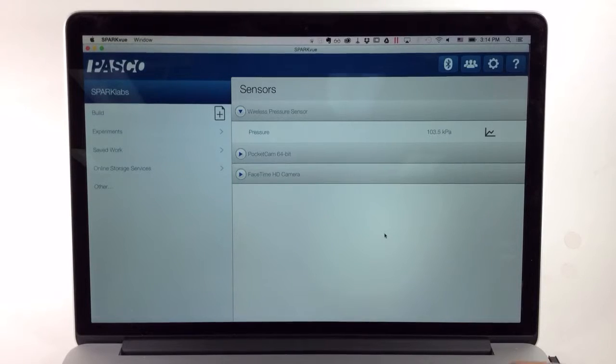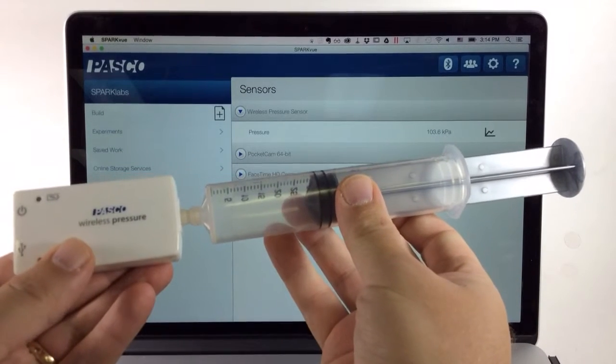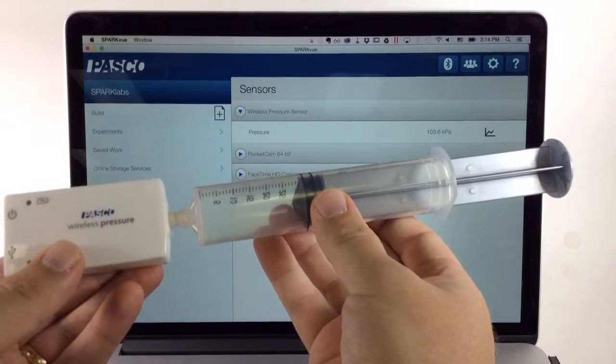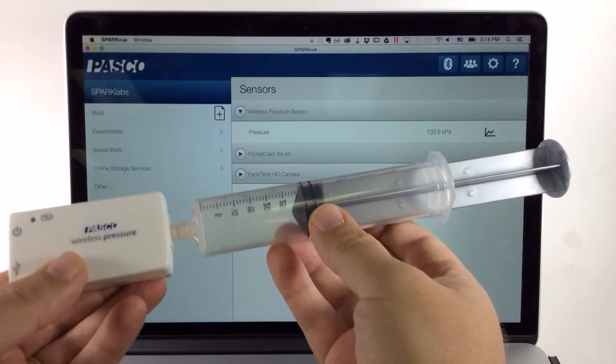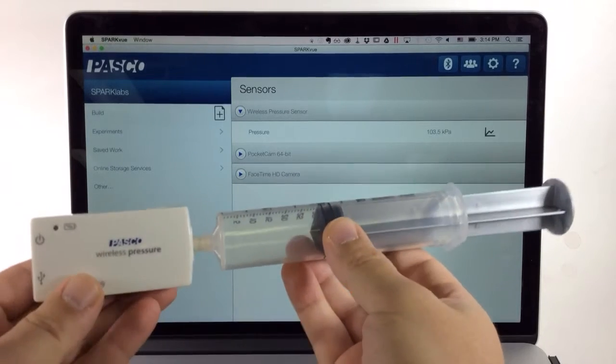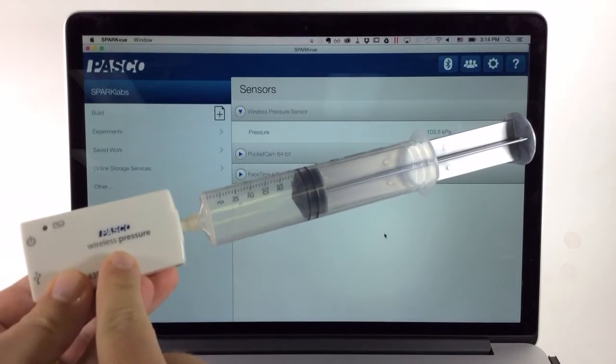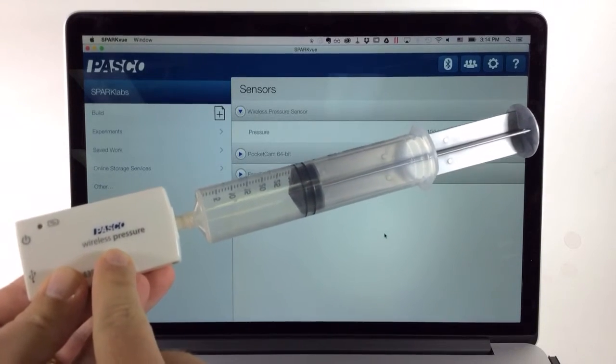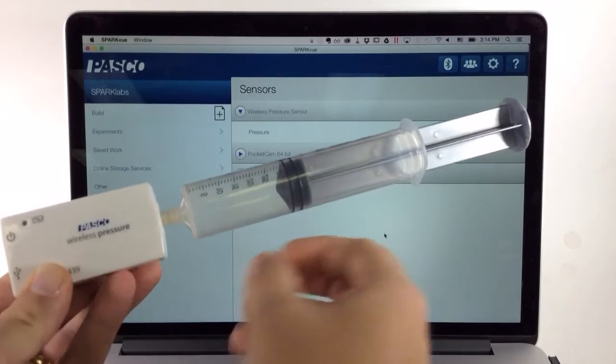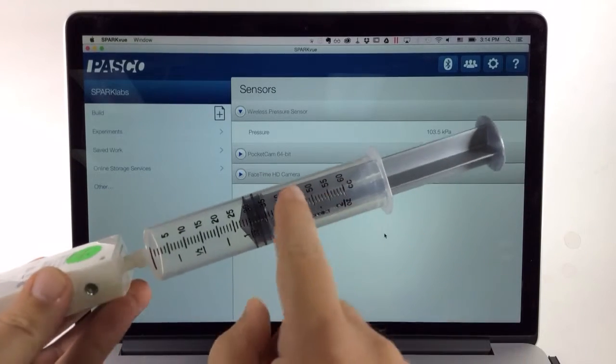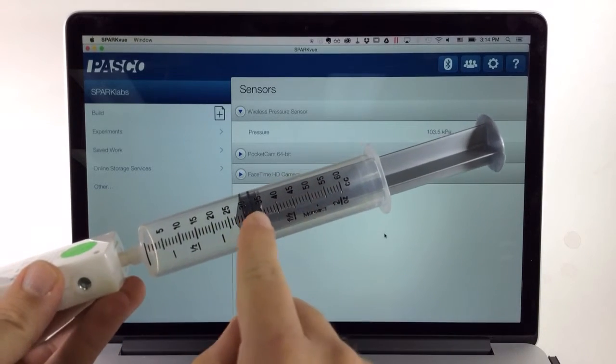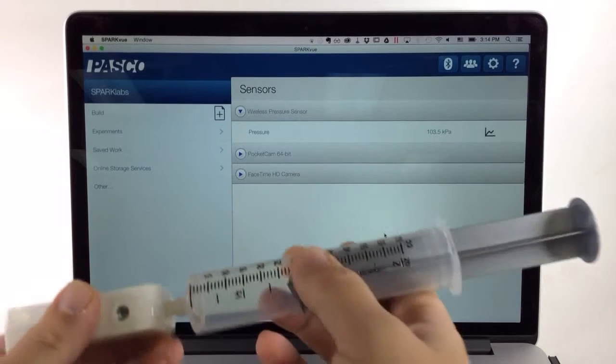How do I configure SparkView to record manual sampled sensor data alongside user entered data in a table? In this example, I'm going to collect pressure sensor data from this wireless pressure sensor and correlate it in a table with the corresponding volumes right off of this syringe.